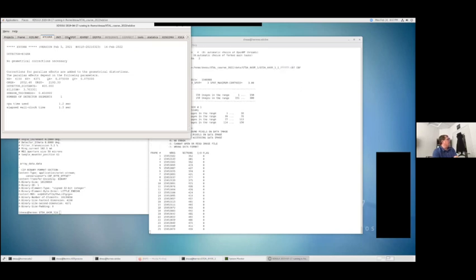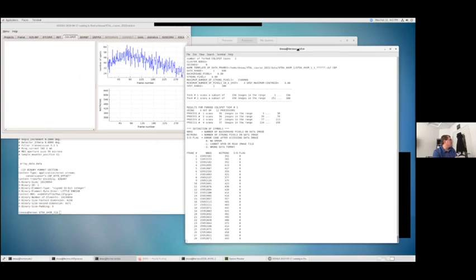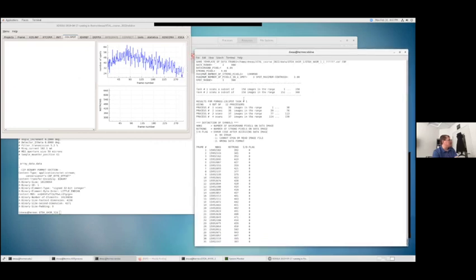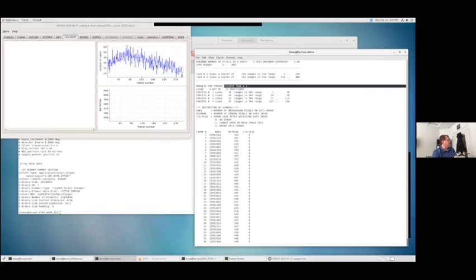The first one you really want to look at is colspot. It's currently running that, so I can see this is saying it's colspot task number 1, and it's still putting out information. So it will be updating this as it goes.